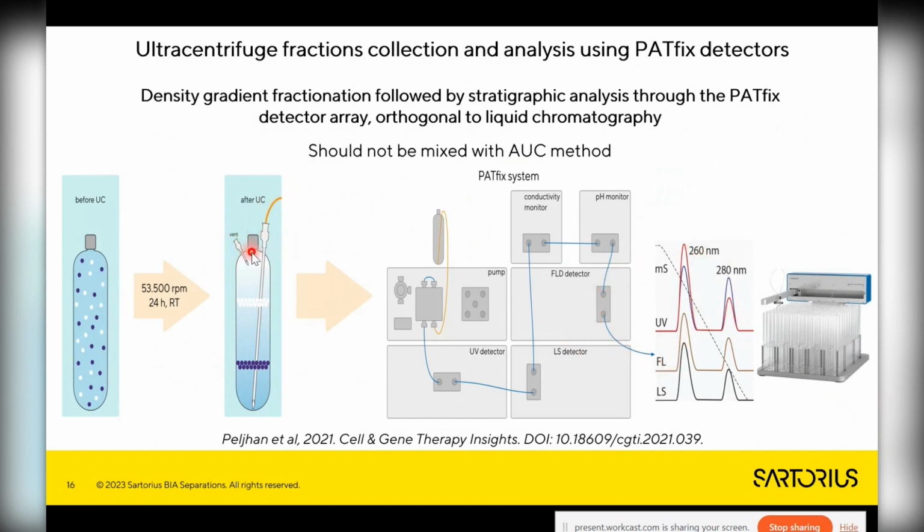So once again, we push the cesium chloride, in this case slowly, to push everything out through the capillary after, of course, centrifugation. The white means the empties, and the blue here is the full capsids. No column is used here; it is just ultracentrifugation and running the material from the tube to the detectors, and after the detectors you can even put in a fraction collector.